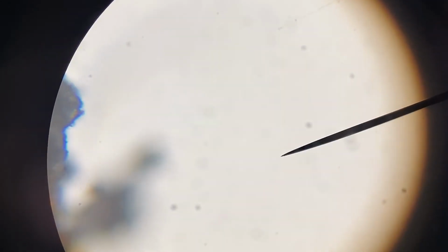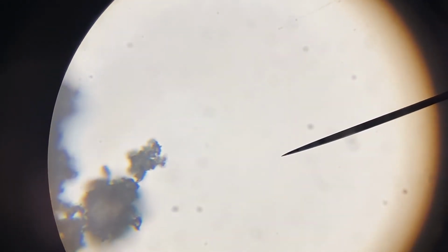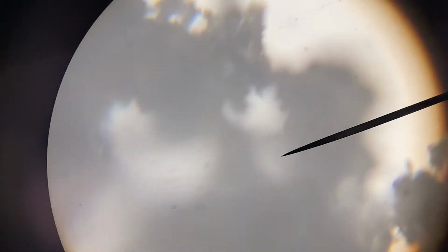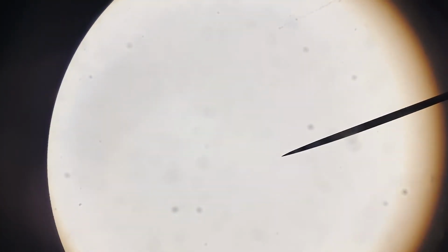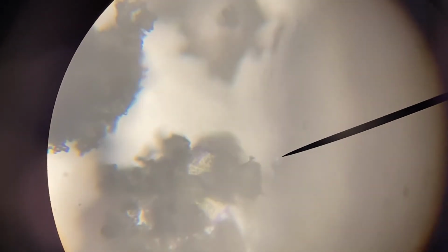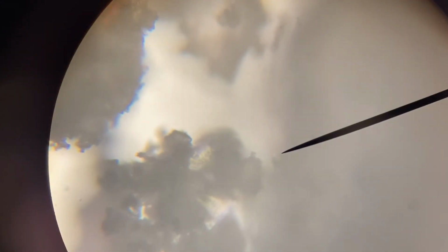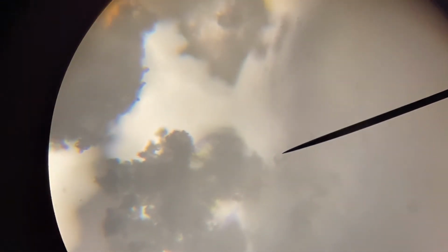Now this one might get dicey because I don't have a cover slip on here. There we go. I'm gonna move it just a little bit. I'm moving the slide on the microscope. This is as big as it's gonna get, folks. If you're wondering what I did, I switched it over to high power. We're seeing it 400 times its size in reality. Uh-oh, I lost it. We're seeing it 400 times its actual size.